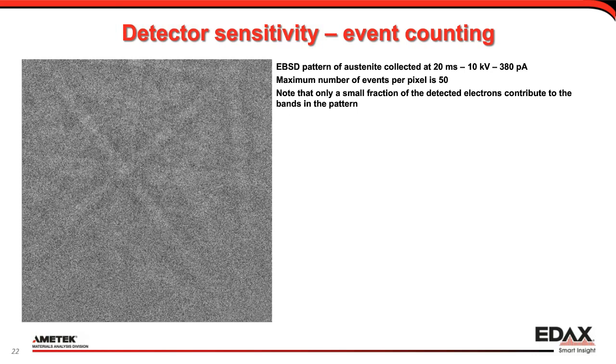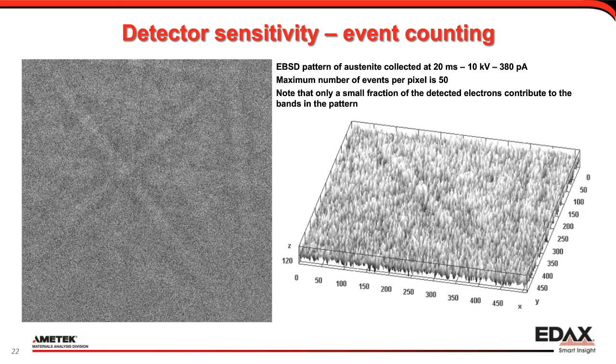And if I show this in a three-dimensional plot, you can see that flat fielding has worked really well, and that the bands are not continuous, but they are just individual spikes of events that we have detected. But the band detection, if this is what you want to use in the Hough transformation, is very efficient in averaging intensity variations along lines, so brighter bands, and that means that on a pattern like this, it's not a problem to find the bands and collect good data.